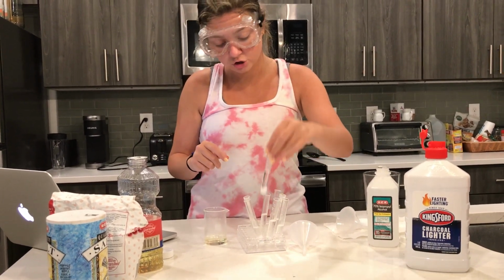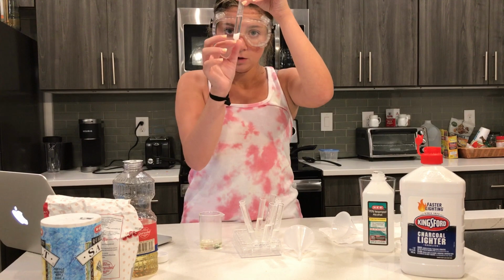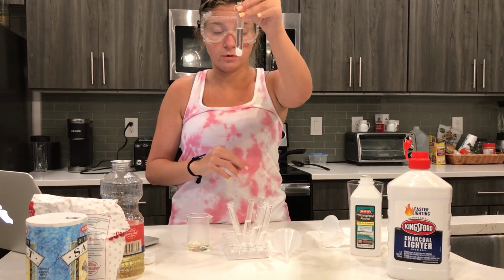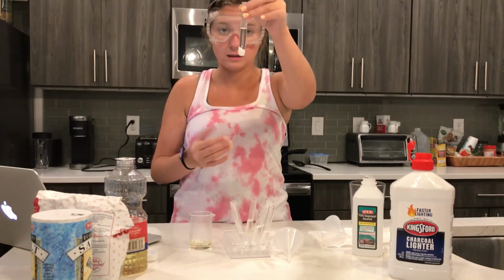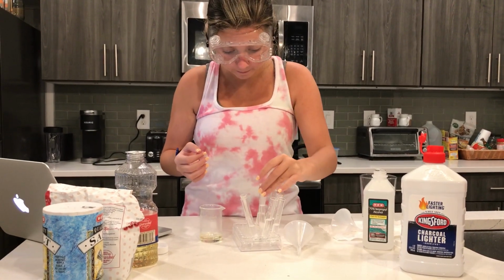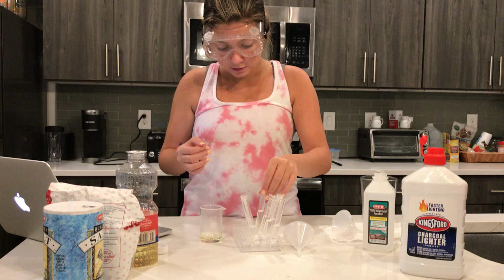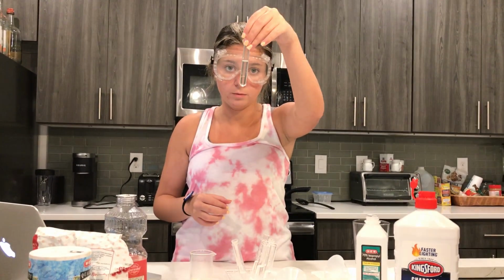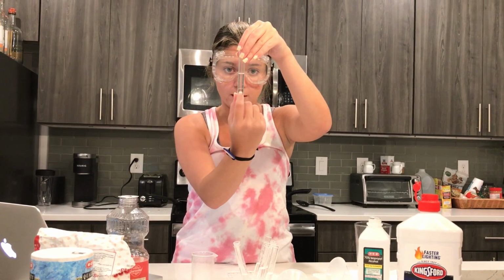And then we have sugar and alcohol, which also looks a little bit mixed, but not really. There's just still a bunch of sugar at the bottom.